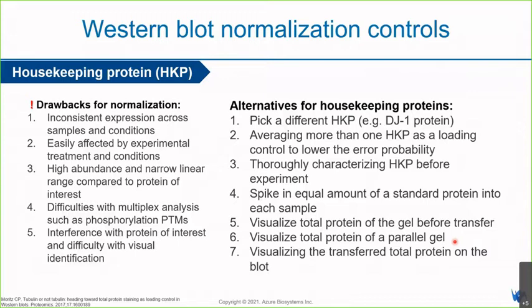This method is okay, but it will not be very good if you do not have a lot of samples. You have limitations in terms of sample collection. And another important thing is that the other gel stained for total protein does not accurately represent whatever you are observing in your current blot that you use to detect the changes between groups in your protein of interest.